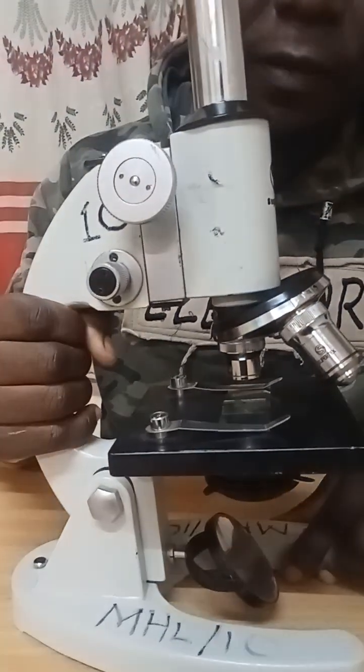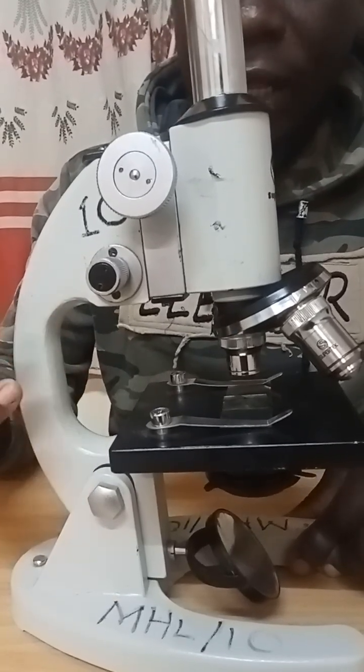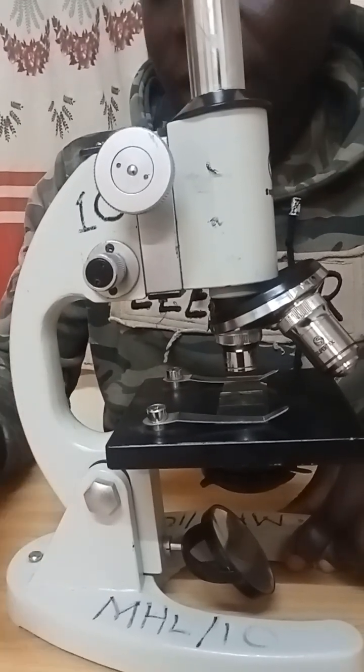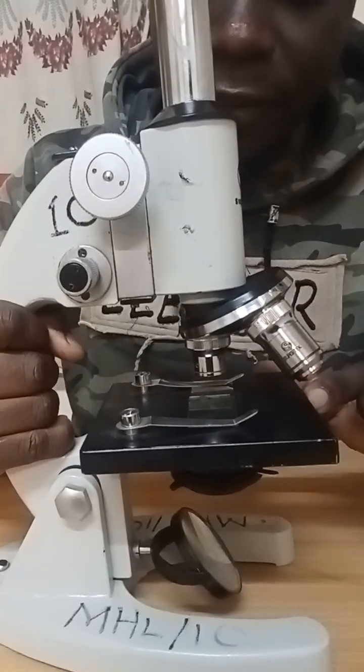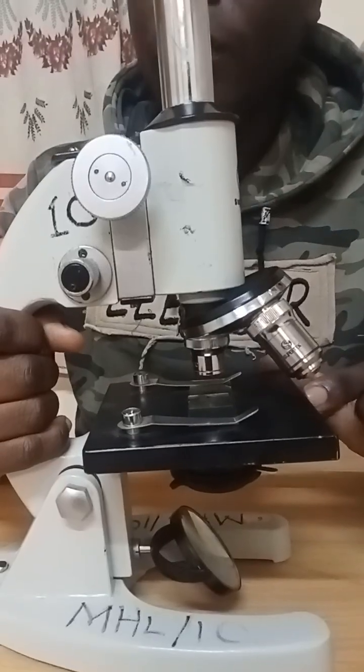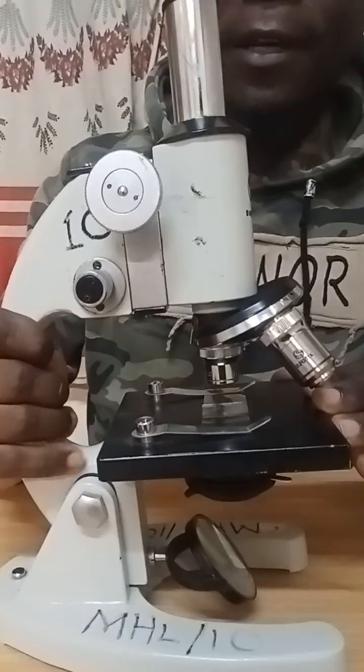And this light microscope, for example, this one is a light microscope. It uses light to illuminate the specimen. Therefore, you can see the specimen. While the electron microscope uses beams of electrons to be able to view the specimen. Let's move straight to the parts of a light microscope.